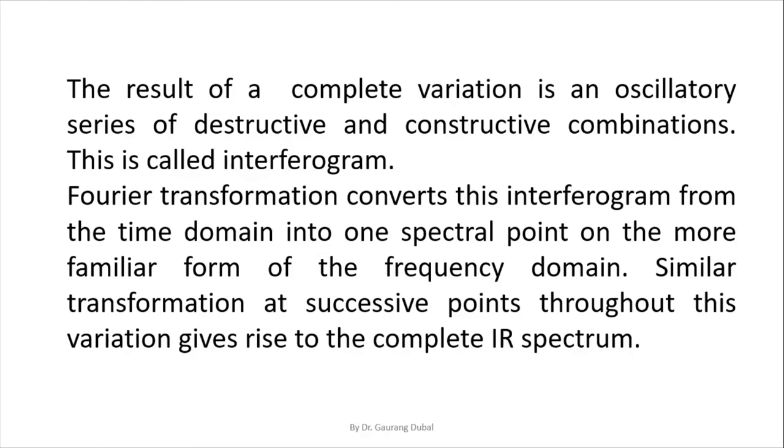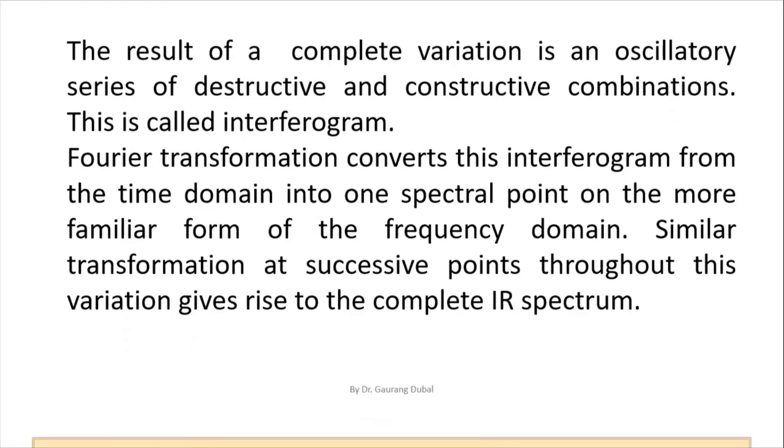Similar transformation at successive points throughout this variation gives rise to the complete IR spectrum. Iska matlab kya hua? The transformation at successive points throughout this variation gives rise to the complete IR spectrum. So after all this process, with the help of Fourier transform, we are able to generate an IR spectrum from the interferogram. So this is all about the principle.